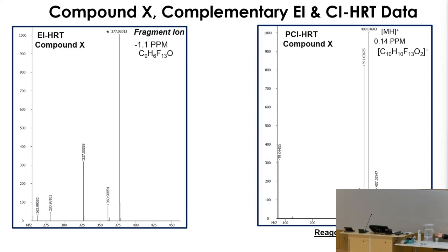It's a multi-mode source to collect CI data. And that's where the power starts to come in. Because that EI data, I'm going to show you a lot of this skinny data. That's a term that I stole from Jack Cochran. A lot of the old school guys remember Jack Cochran used that terminology. There's not a lot of information in that EI spectrum, but there's a lot more in the CI spectrum.